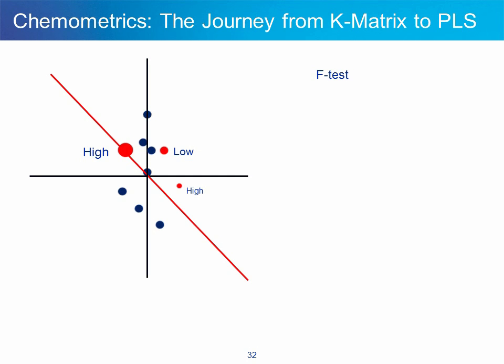While it is arduous to explain the F-test mathematically, it is very simple graphically. On the left, we show that a high F-test value corresponds to a large value on a discarded non-principal component, or, put another way, a factor which describes primarily noise.